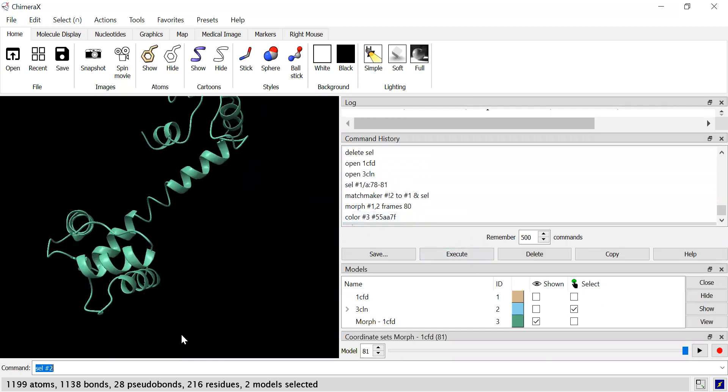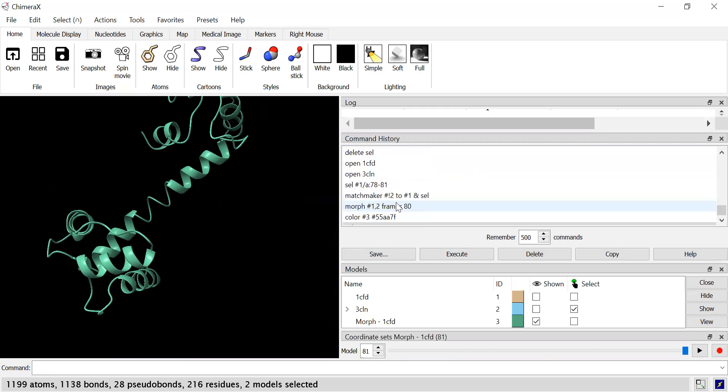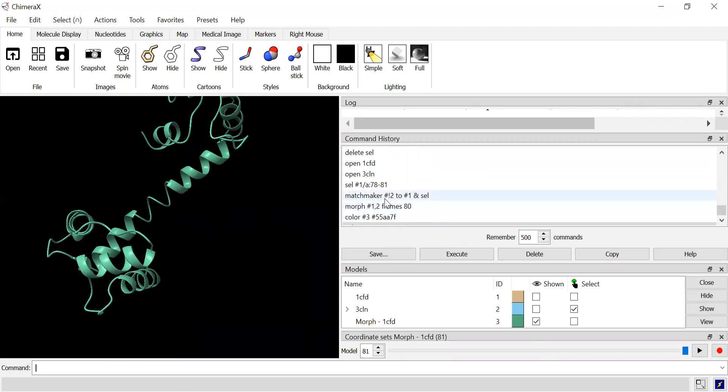So now we've got this. Now, it's actually really easy at this point. So I've already selected it. It's hidden because it's more helpful for getting rid of, for not showing all the waters.